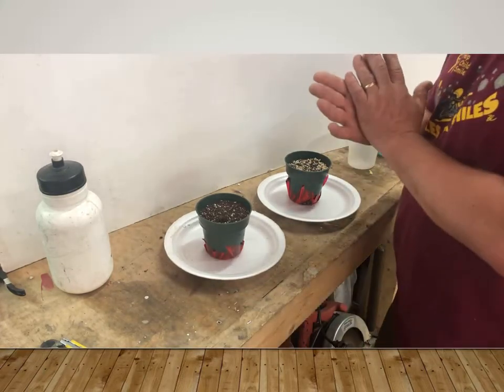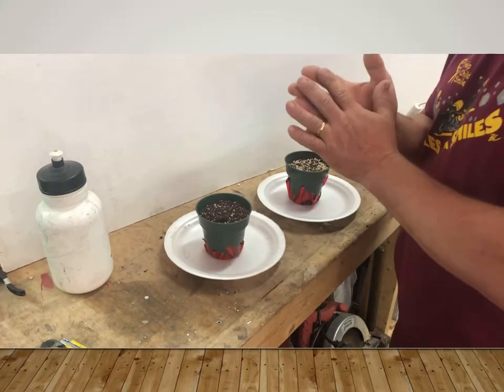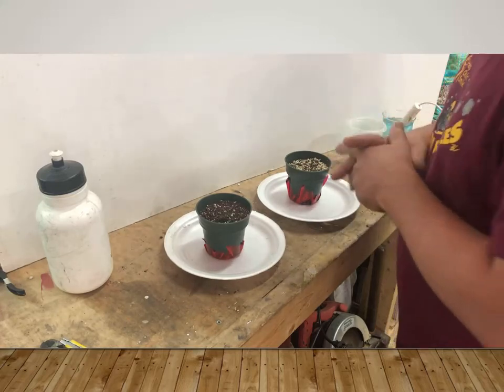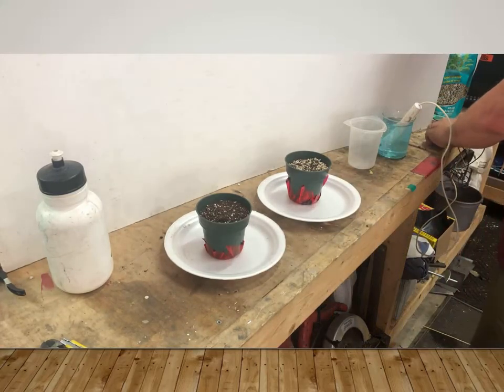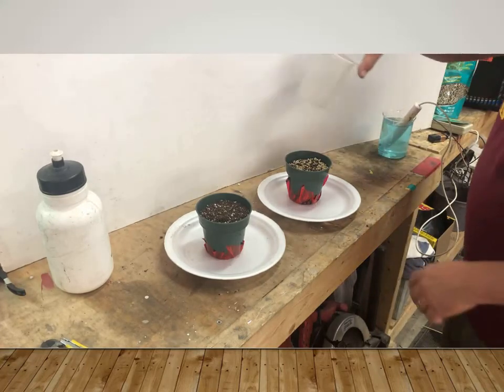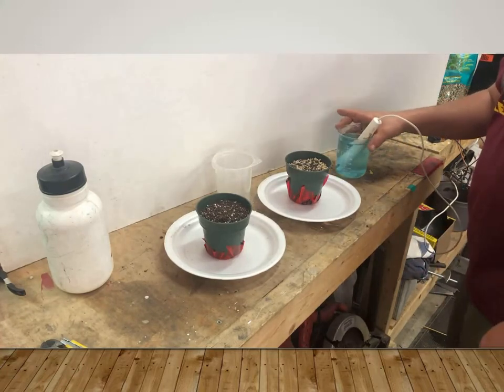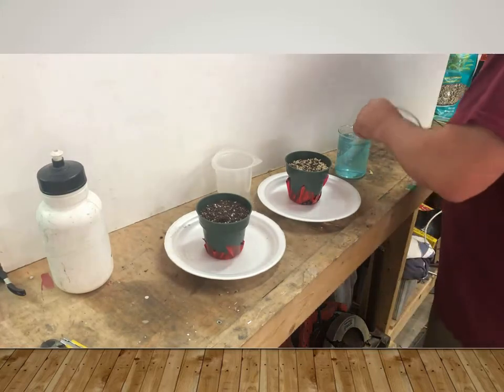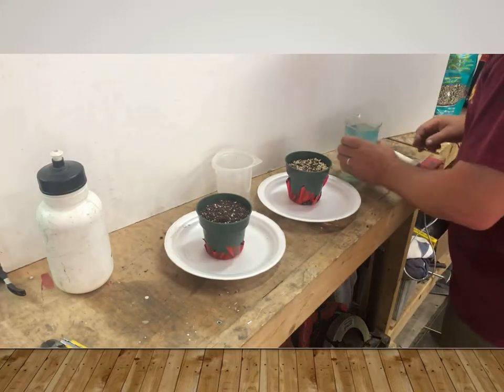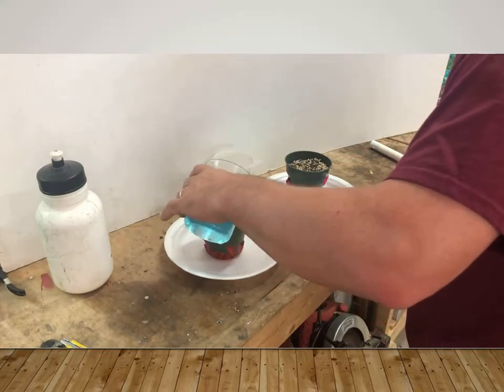But one of the properties of vermiculite, because there are these thin sheets of mica, is that they have lots of negative charges. So I have over here, let me turn my meter on. I'm going to do a pour through analysis here. This is my fertilizer solution that is sitting at an EC of 4.5. So let's set this aside and let's water in the standard porosity mix.